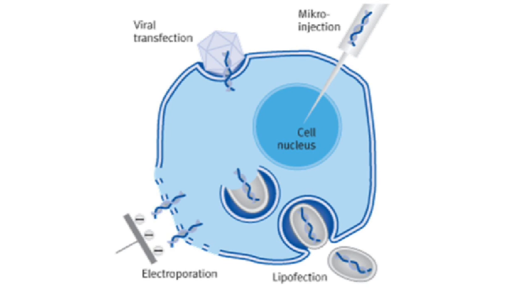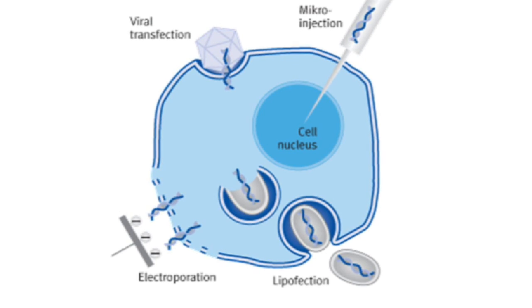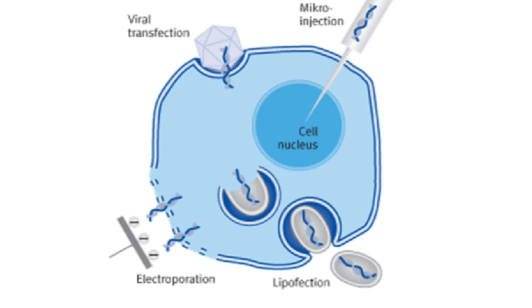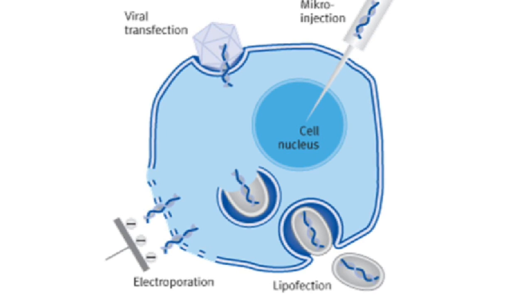The transfection of animal cells is generally carried out by opening transient pores or holes in the plasma membrane of the cells by electroporation to allow the passage of the genetic material. In addition to electroporation, other techniques can be used to effect transfection, such as lipofection or sonoporation.